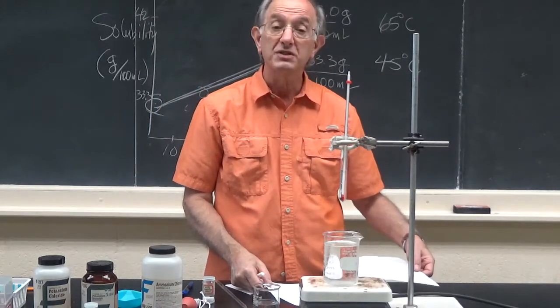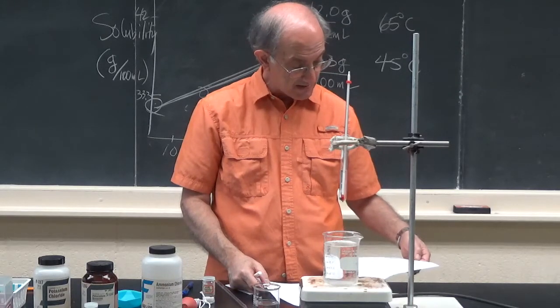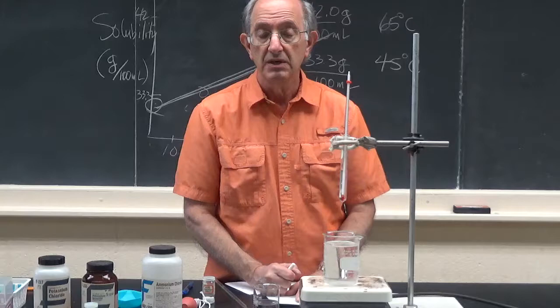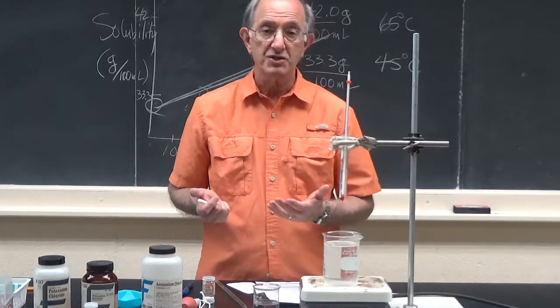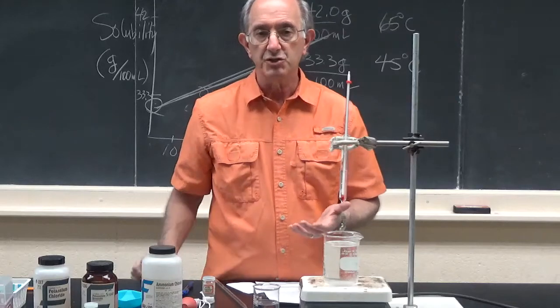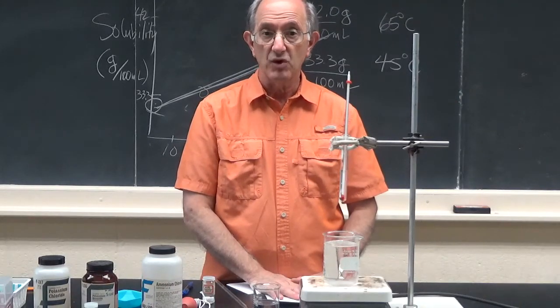And there are a couple of discussion questions, and I believe that's about all you need to know. Dr. Shane and I, as always, are willing to answer questions. We'll probably give you a really short pre-lab that goes back over this, just in case you do have questions.